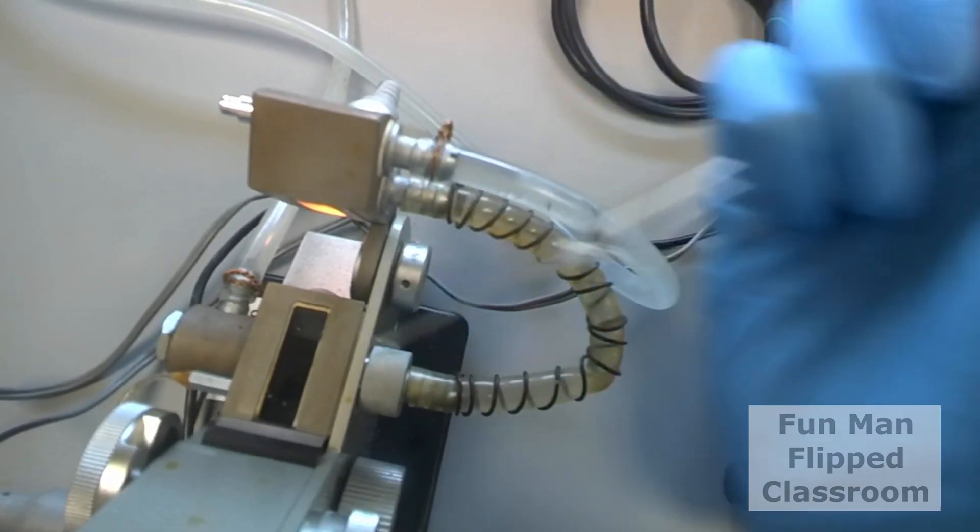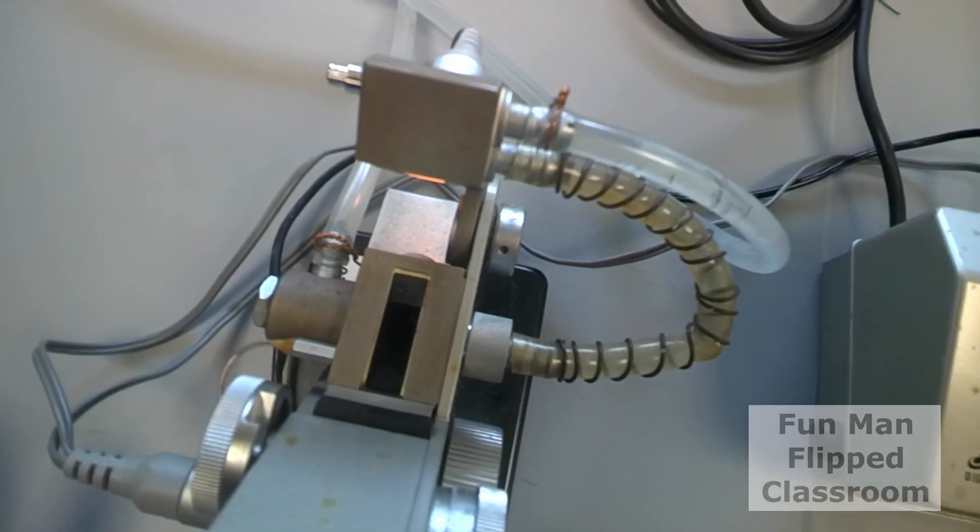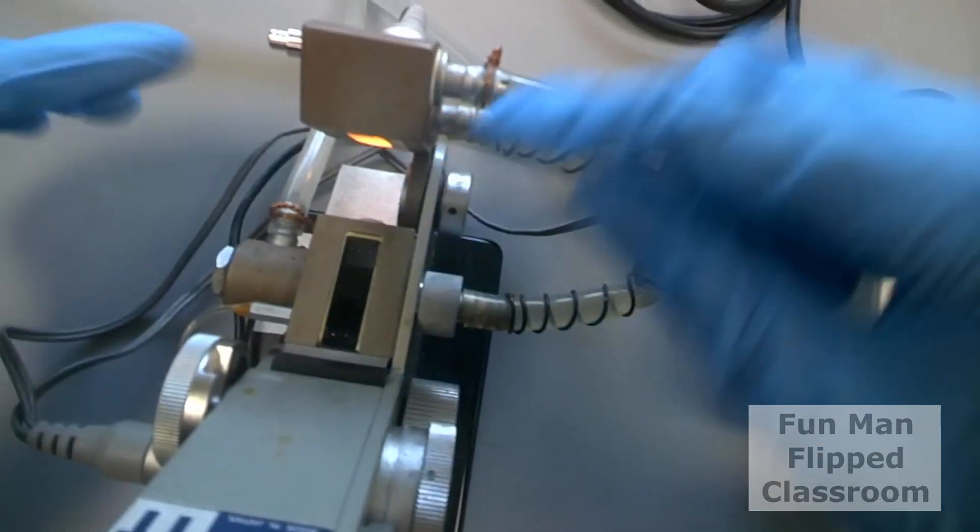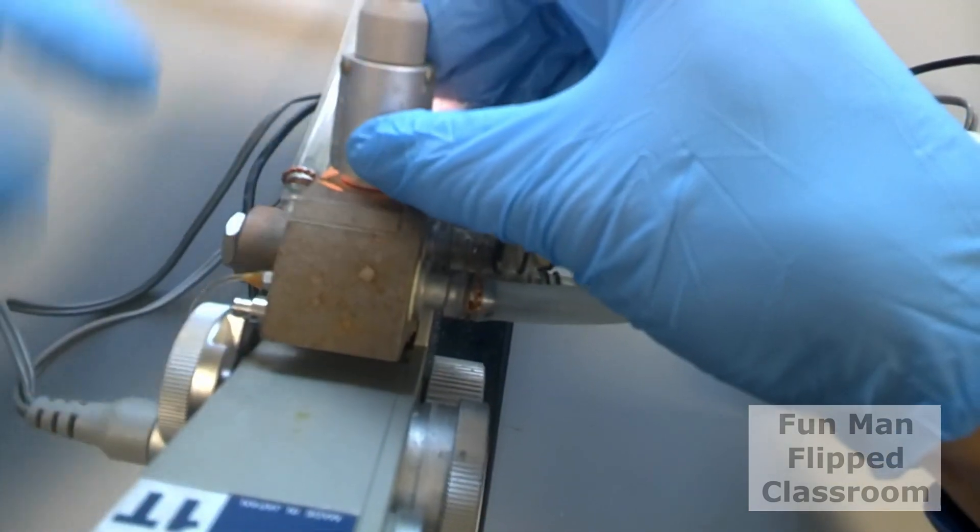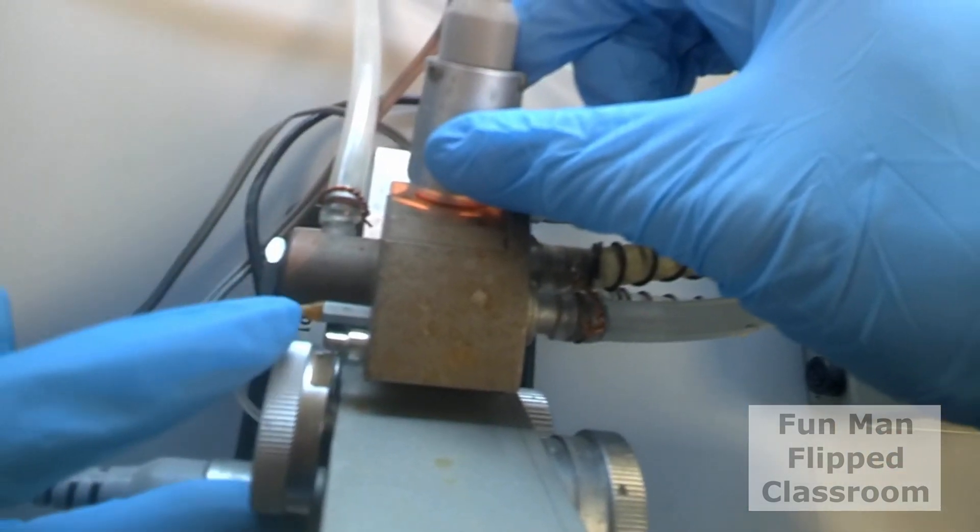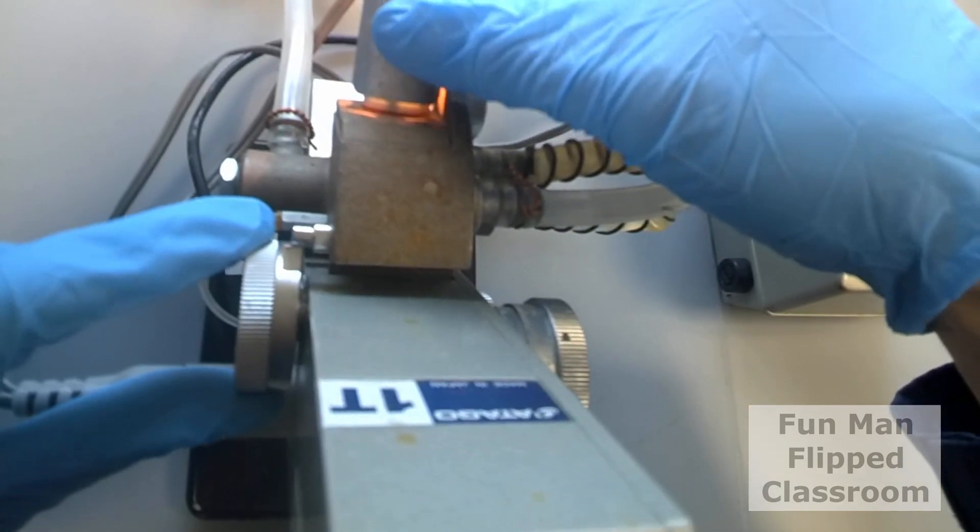Place several drops onto the sample prism. If you don't use enough sample, it will be difficult to see the mark. Too much sample will cause splashing and potentially contaminate the area. Close the sample prism firmly and rotate the prism switch to lock it in place.